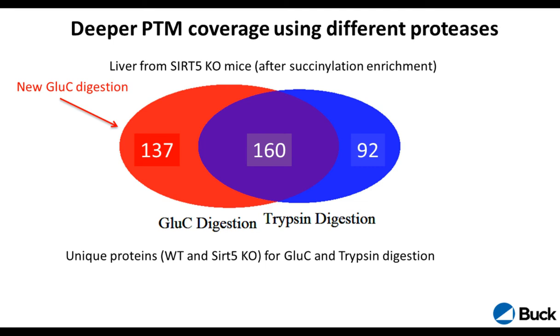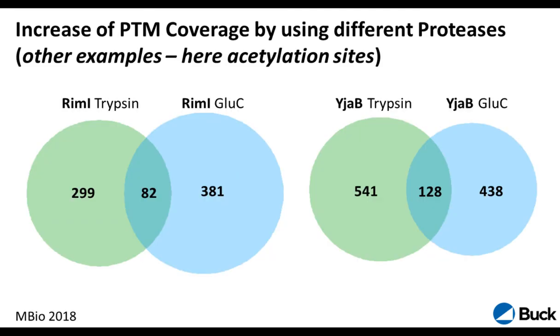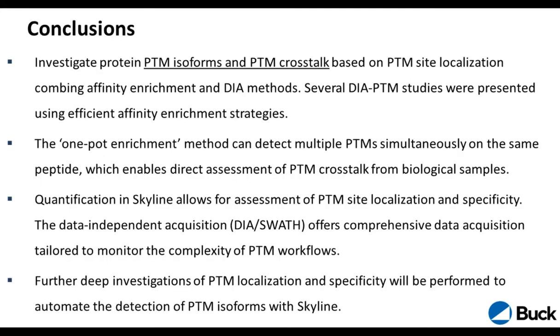So when it is important enough, we actually do use this approach of different proteases. So we feel we get a really deep insight into PTM space. And this was actually true also for this other project that I showed you earlier in the E. coli data, where we were looking for cuts. We used different enzymes here, trypsin and glu-C, and were able to see a whole different set of PTMs that were not even detected before. And the reason for that was purely that it didn't generate a well-ionizing peptide. So there are a lot of chemical and biochemical tools in order to look at PTMs.